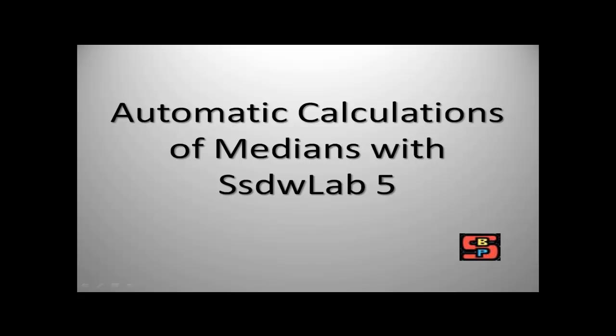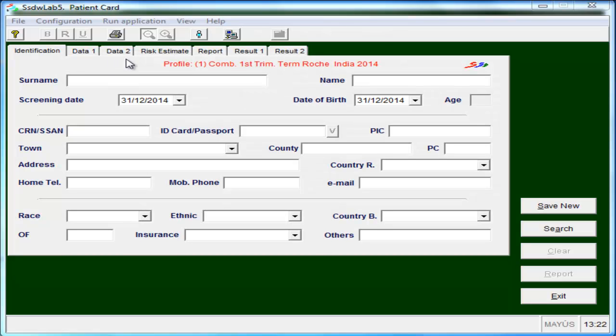Automatic calculation of medians with ssdwlab5. Let's see how to calculate medians automatically with ssdwlab5 when we have sufficient records for these calculations.